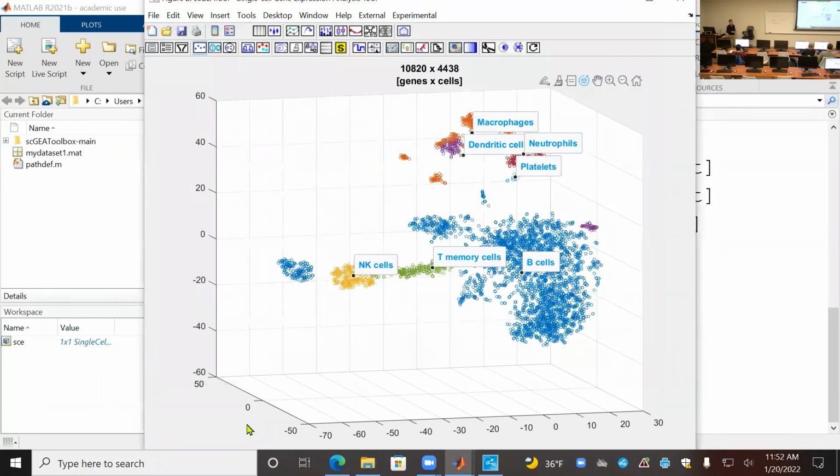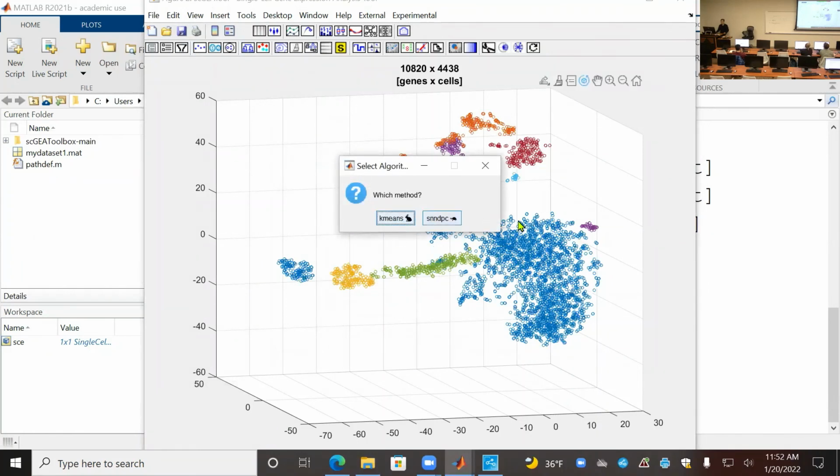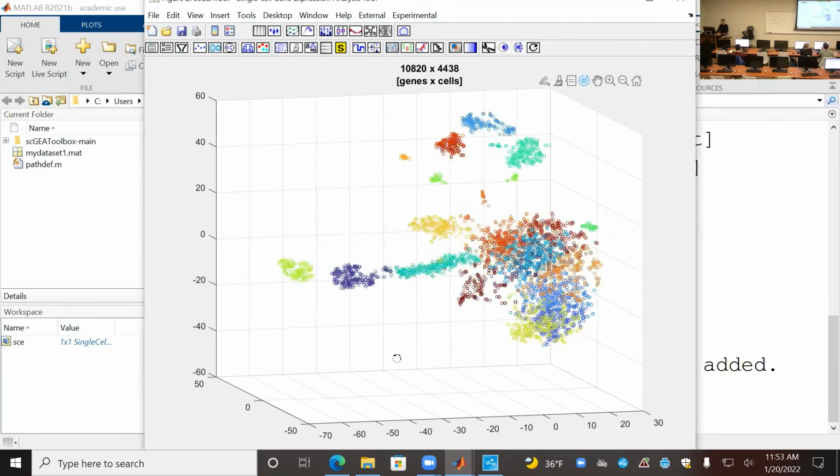Delete the cluster by cell type again. I missed it. Okay, figured it out on my own. To make clusters, click this. Use one of the methods, and this one with the rabbit is much faster. And I recompute. I tend to over-cluster them because I want to have the subtle details of the small clusters. If we don't, we do something like 20, then that's the clusters.